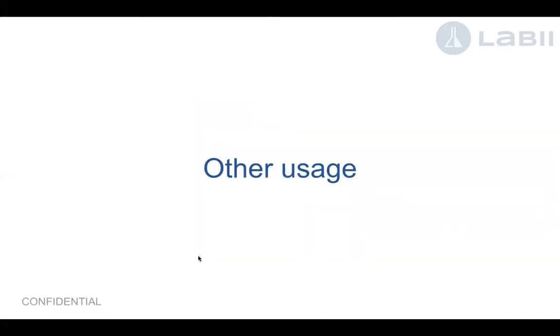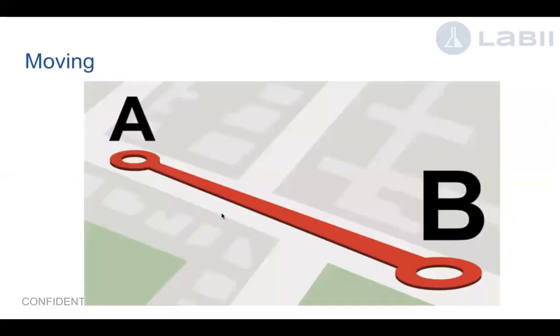And then, of course, there are some other usages. One usage, especially during the pandemic, and this can be used for other things too: many of our customers have been moving during the last year, from one location to another. Traditionally, they need to carry all the different notebooks, but with our system, moving is so much easier for them. They don't even need to worry about it. They just go to the new office, open the computer, and the notebook is still there. So that's definitely one of the usages.